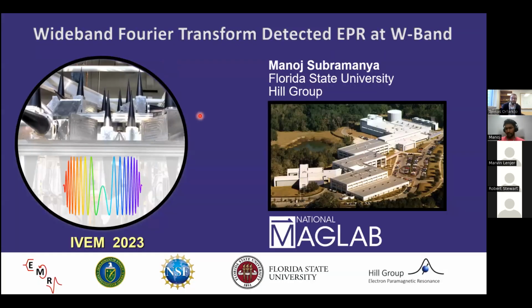Will discuss the results of Fourier transform EPR.